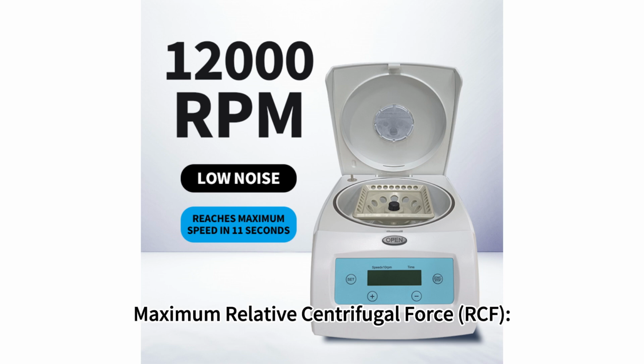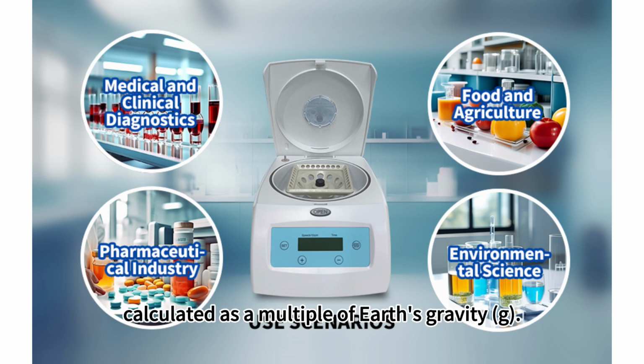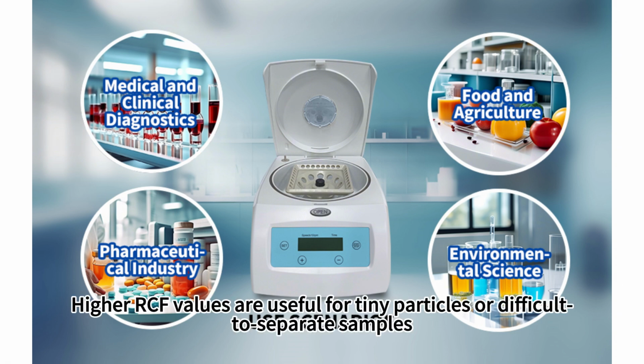Maximum relative centrifugal force, RCF. Description: indicates the force exerted on samples, calculated as a multiple of Earth's gravity, g. Importance: higher RCF values are useful for tiny particles or difficult to separate samples.